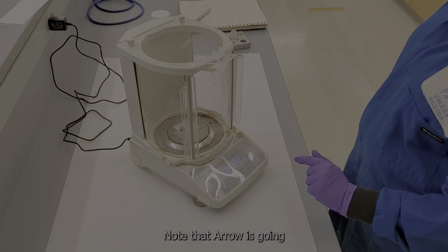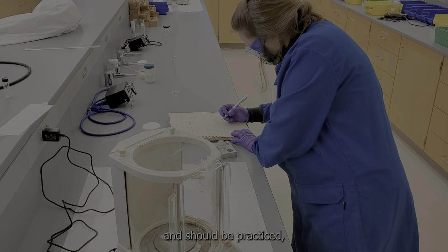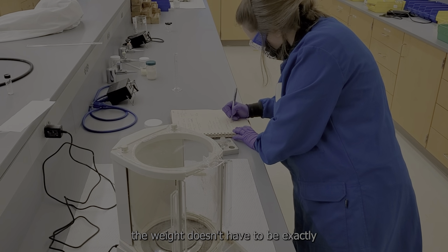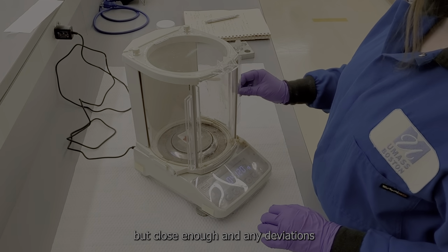Note that Taro is going to write the weight in her notebook. This is essential and should be practiced. So make sure you do this yourself when performing experiments. The weight doesn't have to be exactly what's mentioned in the manual, but close enough, and any deviations need to be recorded.